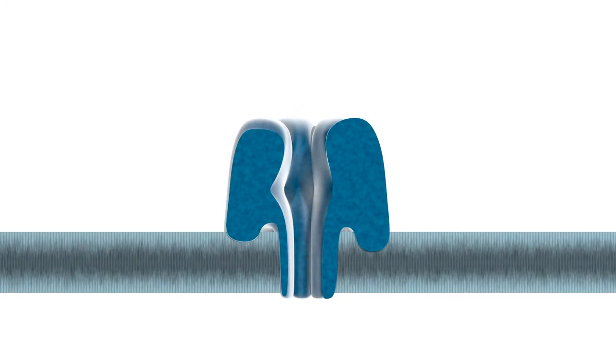A potential is applied across the membrane, resulting in a current flowing only through the aperture of the nanopore. Single molecules that enter the nanopore cause characteristic disruptions in the current, as do larger target molecules, for example a protein molecule, which may pass near the opening of the nanopore rather than passing through it. By measuring that disruption, the molecule can be identified.